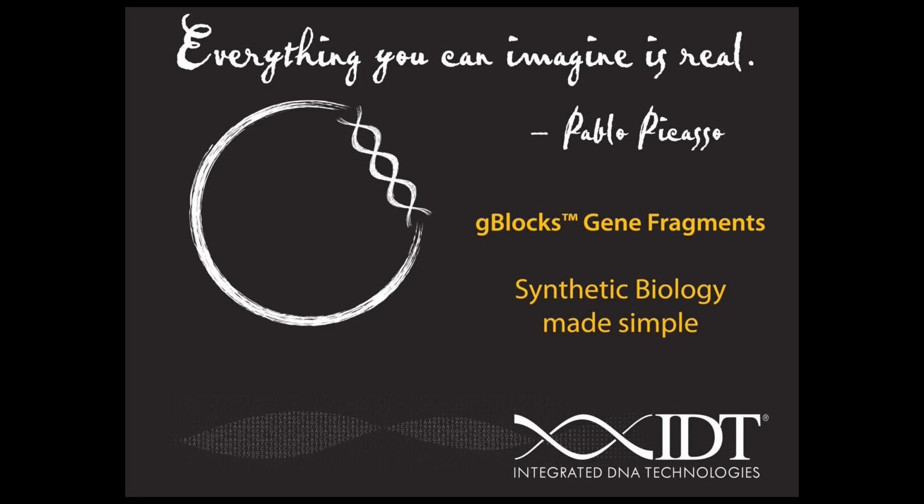We may be able to make some sequences that would have 40 base repeats if it was just a single set of repeats, so one sequence repeated twice within a gBlock. We could look at those individually. The determination for that would probably fall on the exact nature of the sequence, the GC content of it, and the surrounding sequences. But we could definitely take a look at that.